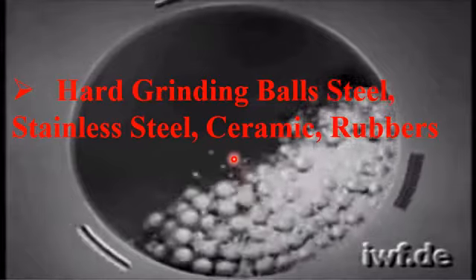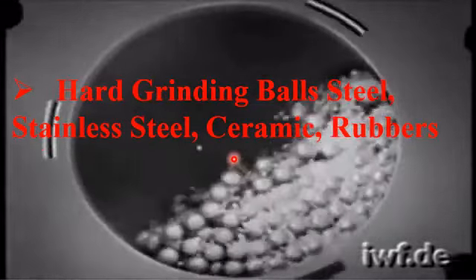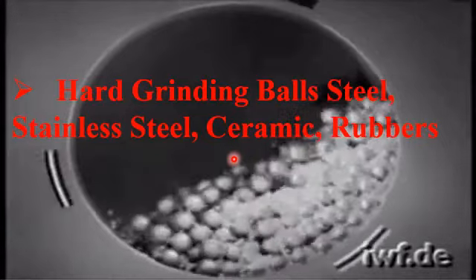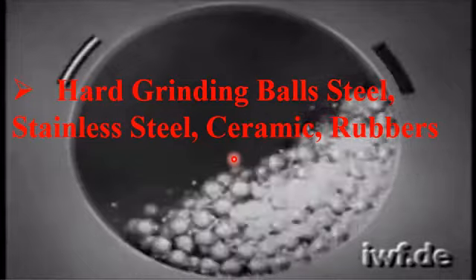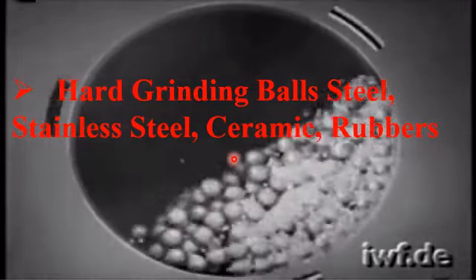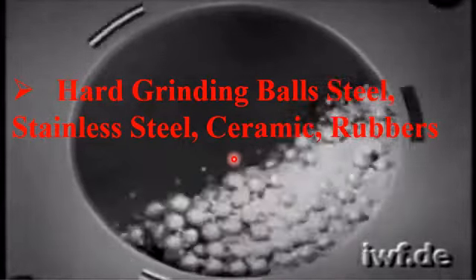Please, dear student, note that the balls used as a crushing material to crush a bulk material are not limited to these. There are also different kinds of balls like flint pebbles.